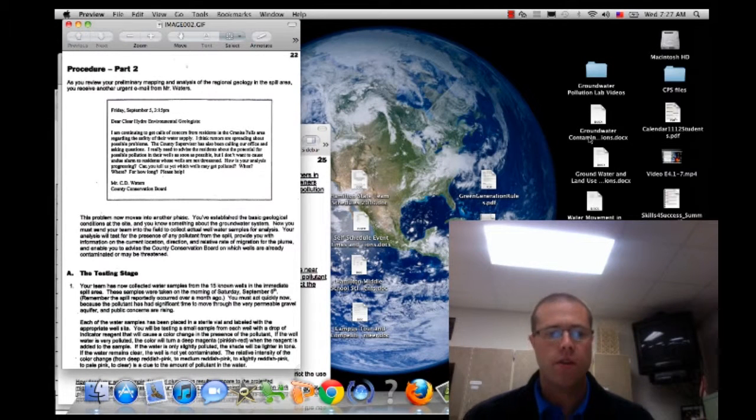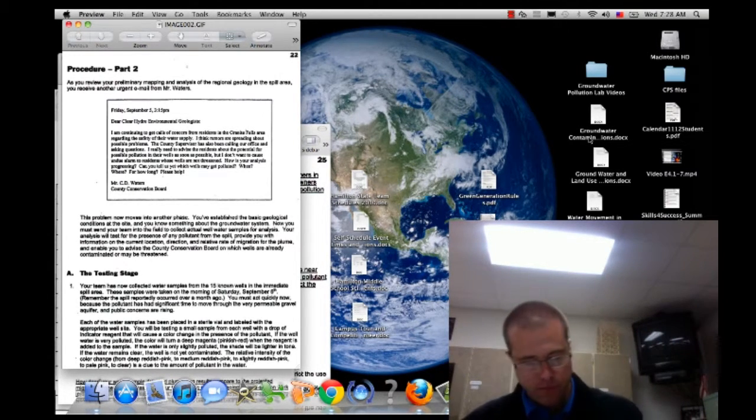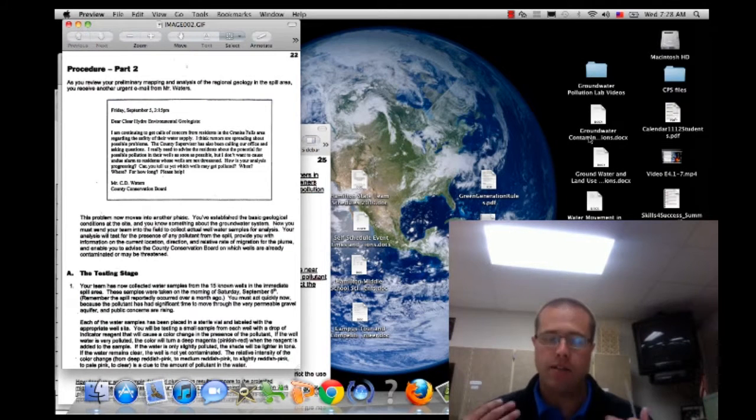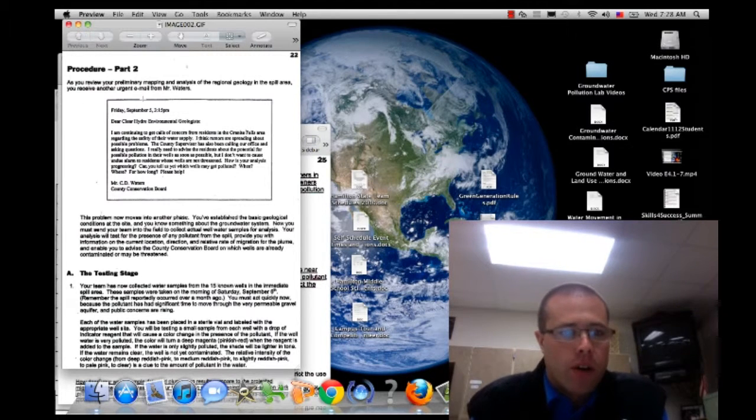Alright you guys, this is video E4.1-9, the last portion of the groundwater pollution lab. We should be looking at our page, procedure part 2 here, and this is where we're going to actually do some testing of the wells in our scenario here. As we read through this, and again it's very important to be reading through this stuff, we find that we have a problem here, and we should be following along right here.